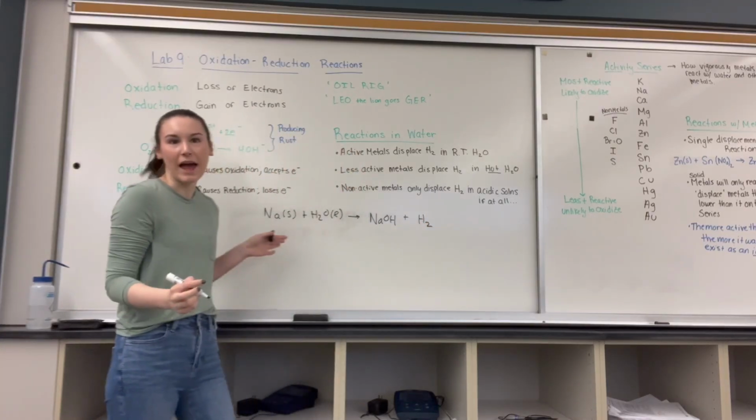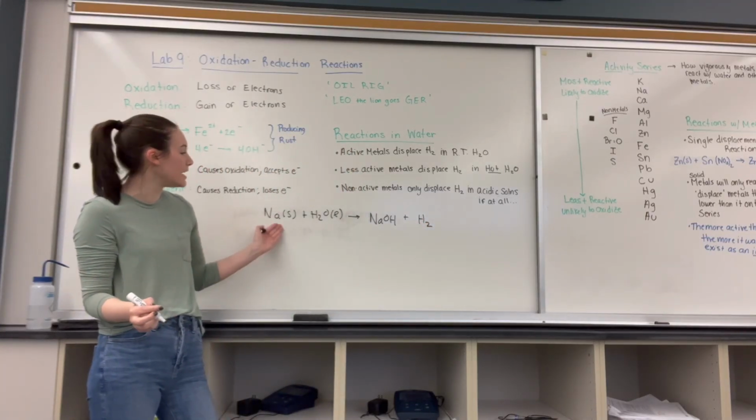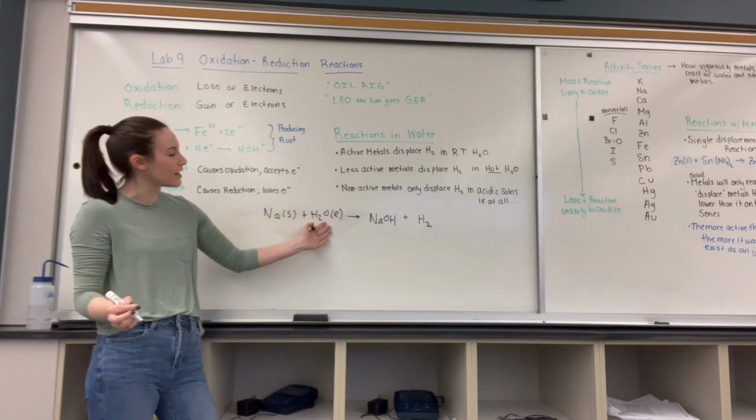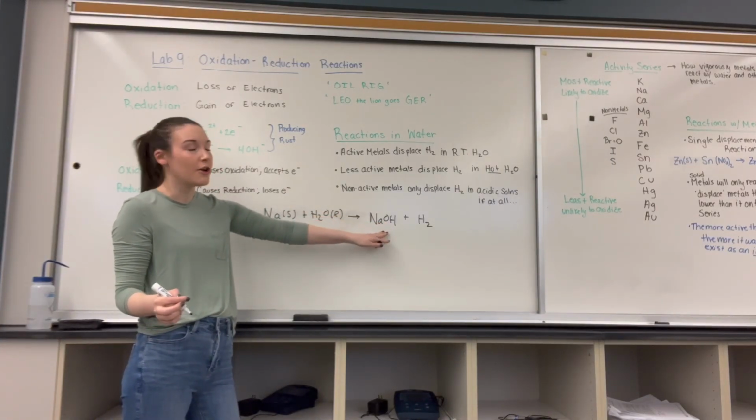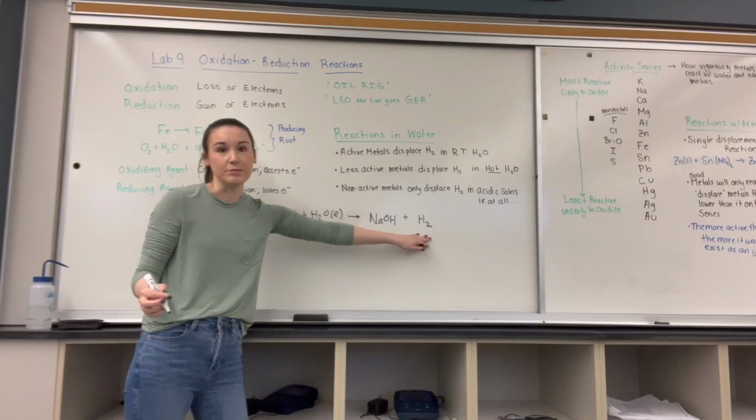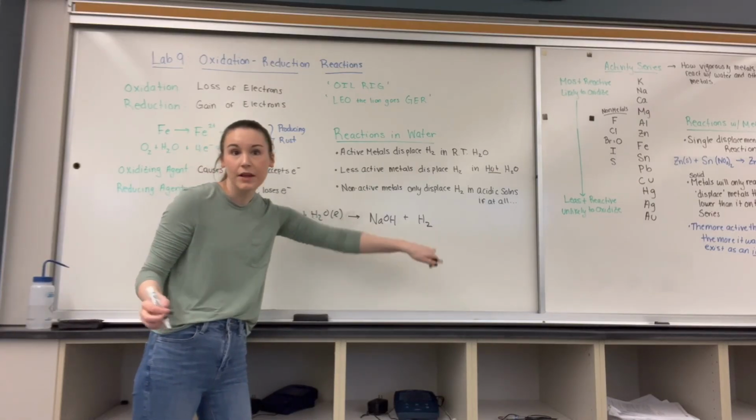Okay, this is not balanced, but this is what's happening. We're taking sodium solid and reacting it with water, and we get a basic solution of NaOH, and hydrogen gas is being released into the air.